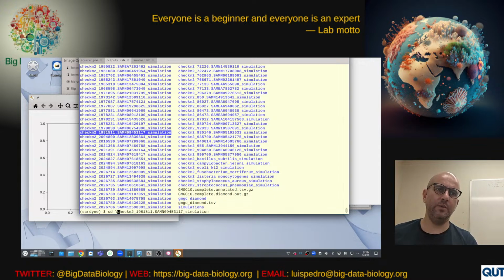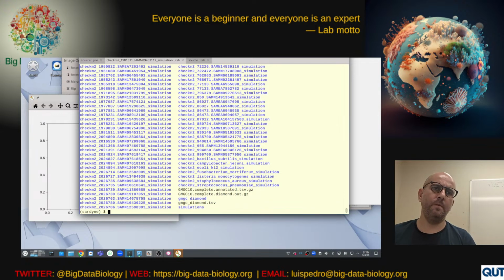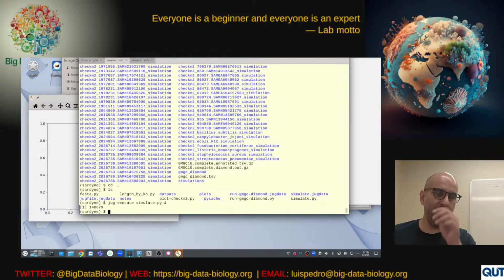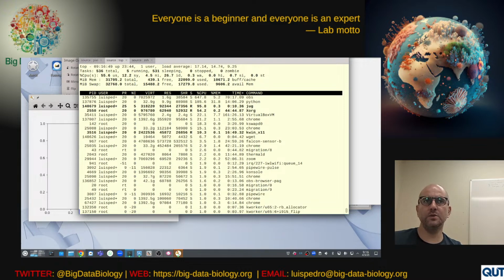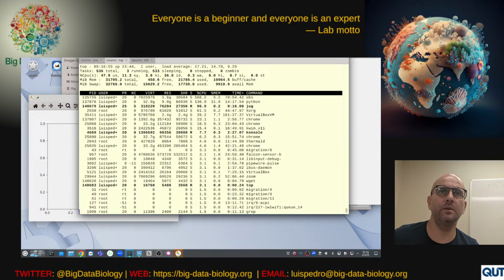We did this thing a couple of weeks ago, where I'm just going to run one more genome. It's always very slow when I have to do this and run OBS, the streaming software, at the same time. But here's Jug running.